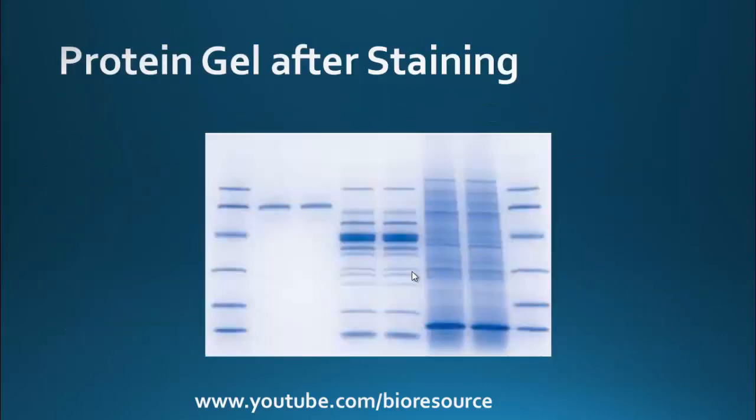So here is the protein gel after staining. Here you can see there are different bands of protein, and all of them are separated based on the molecular weight.